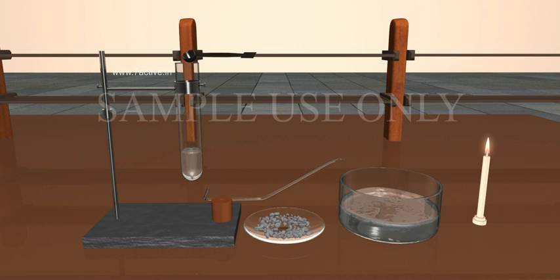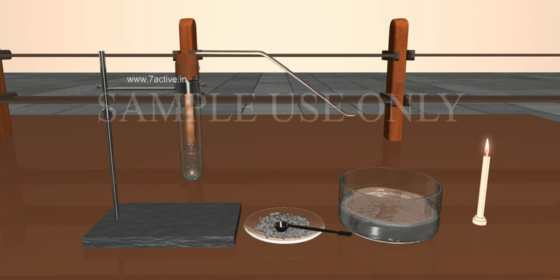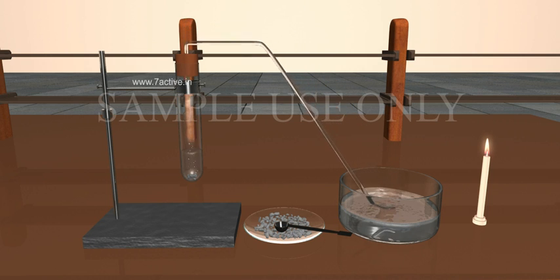Take a test tube containing 2-3 milliliters of dilute sulfuric acid and add a few zinc granules to it. Cover the test tube with a rubber cork. Observe the surface of the zinc granules. We can observe the hydrogen gas with the appearance of bubbles.